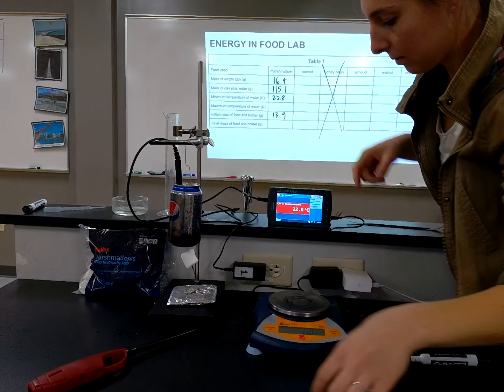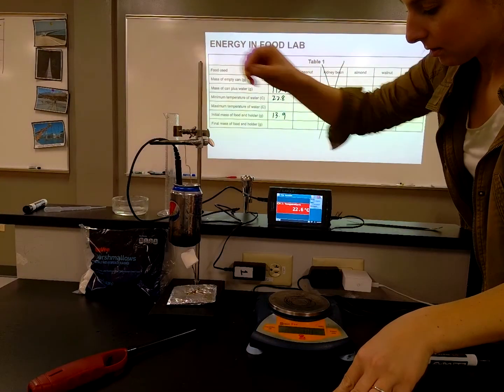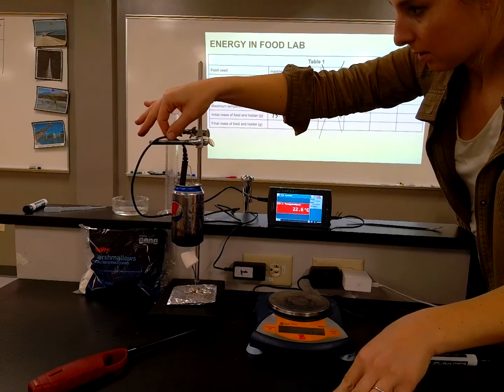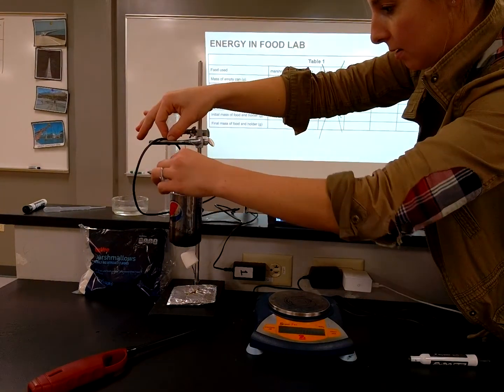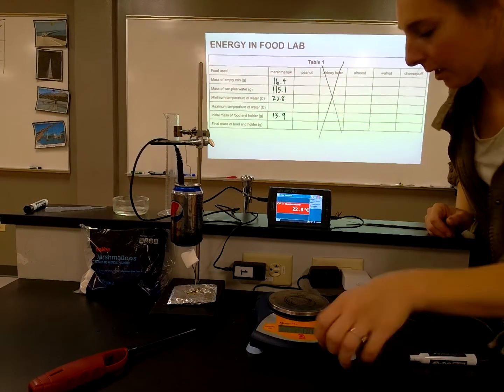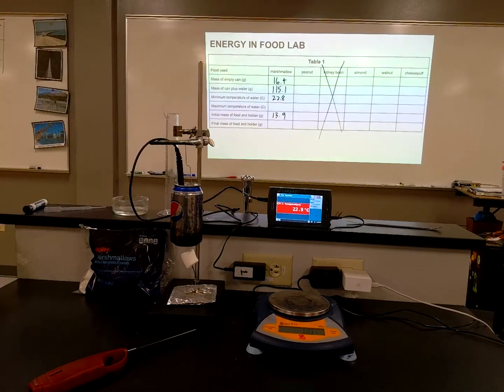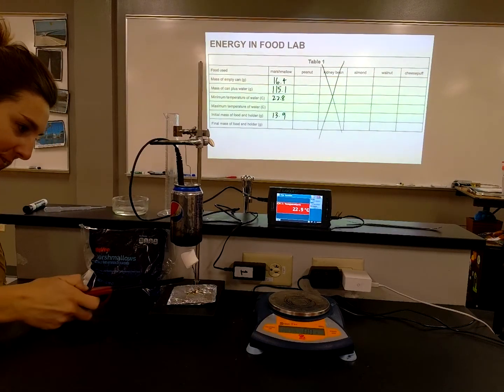All right. Still in the water. There we go, 22.8. Okay. All right, let's burn this food.